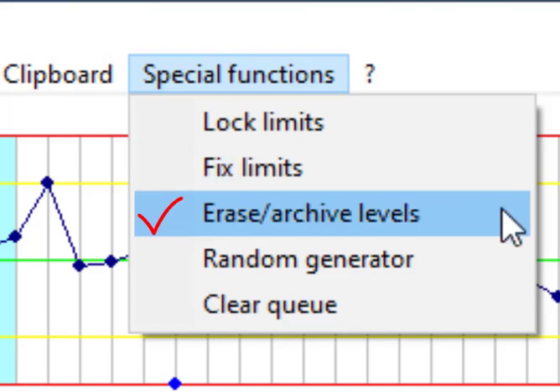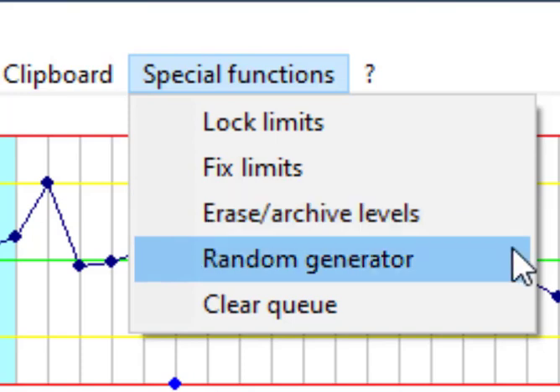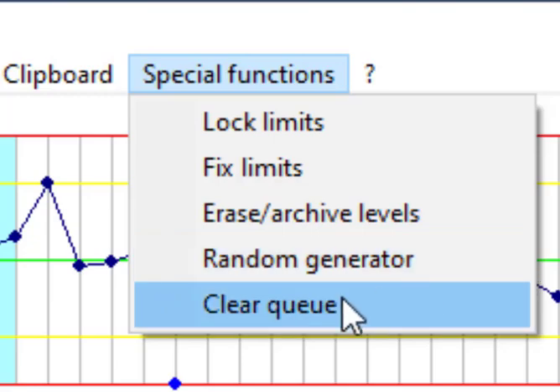We can archive each level that has been reached to a specific number of entered controls. Random generator is used for educational purposes and we have clear queue.